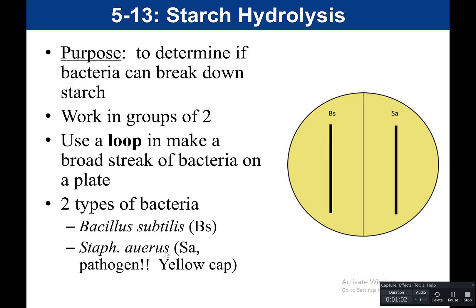The other side you would label SA, which is for Staph aureus. Staph aureus is a pathogen, and we usually keep this in a tube that has a yellow cap. That serves as a warning to say that this one is pathogenic — treat it with care. These two bacteria are in a broth format.